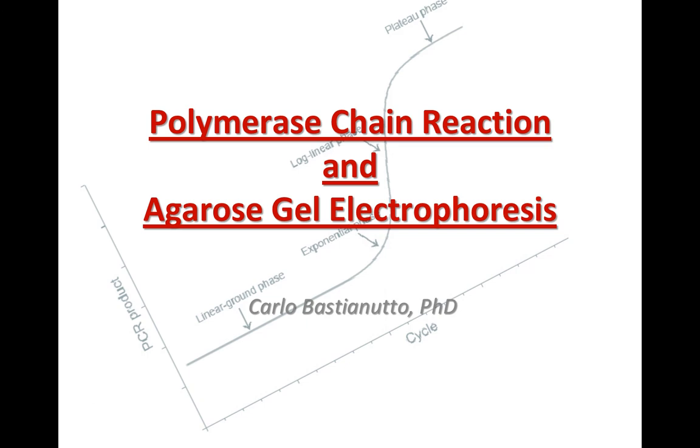Hello everyone. What I'm going to talk about in this lecture is the theory behind the polymerase chain reaction. So we already talked about that in biochemistry, but I'm going to expand on some aspects of PCR, particularly focusing on the topics of primer design, you'll see later on, and the expansion in terms of usage of PCR to different applications and different techniques developed from PCR.